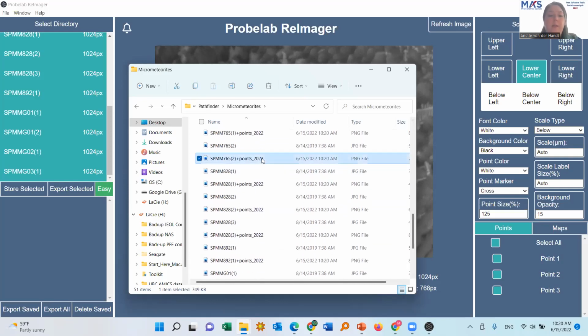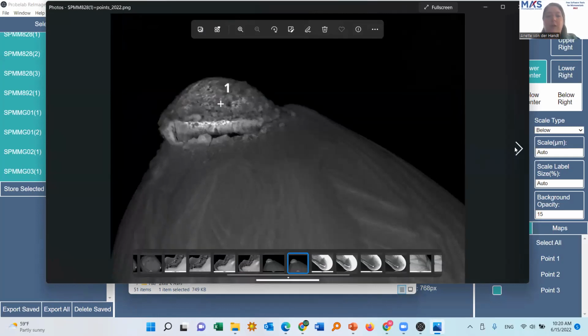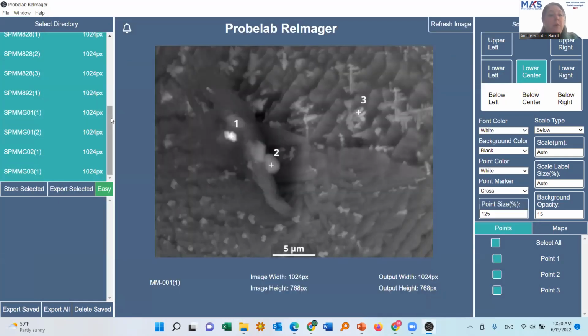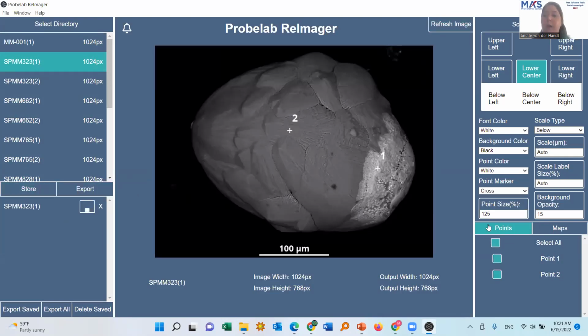We see that we have all these exported files in the naming convention that I want. And they show exactly the annotations that I'm interested in. Okay, let's say I want to switch things in between. Sometimes I want to have a white annotation. I can store that.